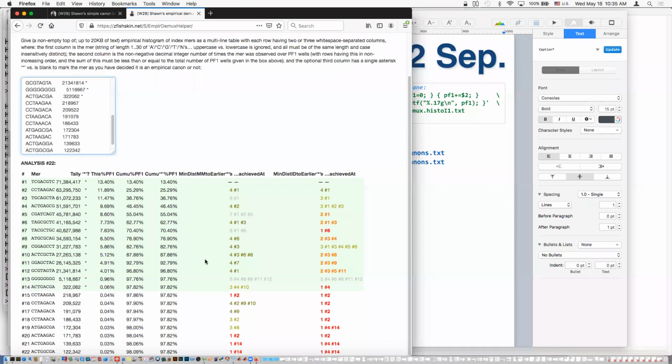Oh, no, actually, here's an interesting case. I promised you that indels happen. Well, here's our first example. Because I'm looking down this column, I'm thinking, oh, I didn't have that guy marked, right? Because he's past the representation break, probably not real, right? Well, he's 3 mismatches away. I was looking down this column, thinking, oh, a 3-mismatch guy, he's right next to this guy, I should probably take him.